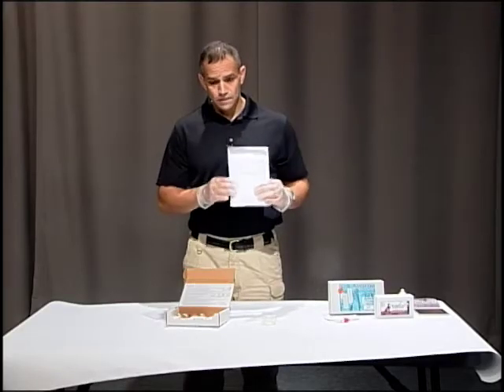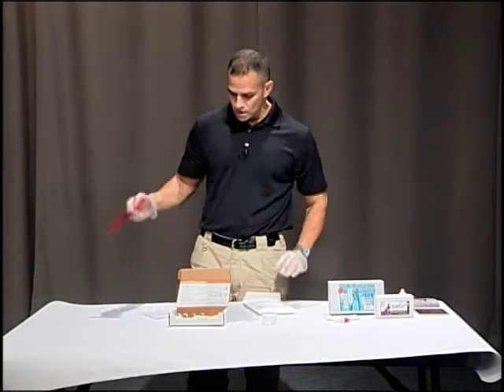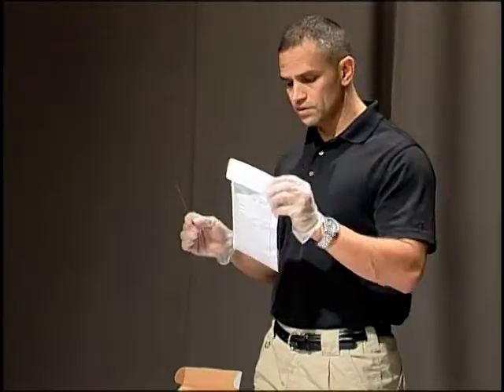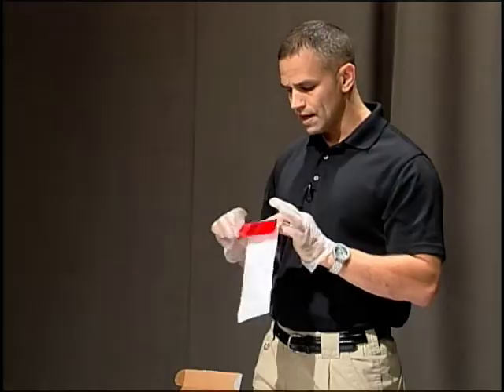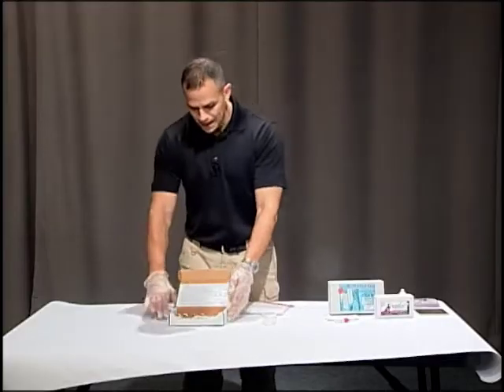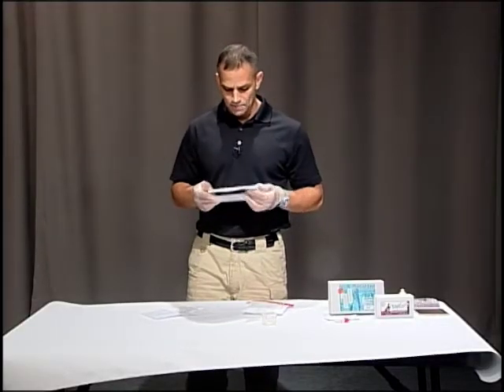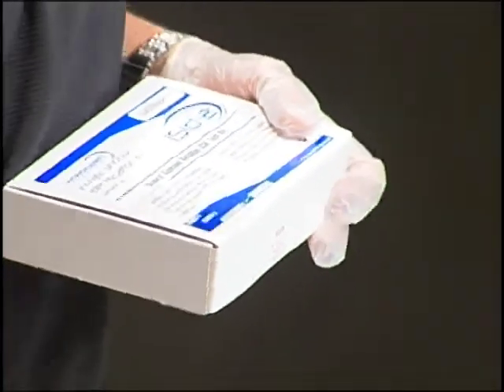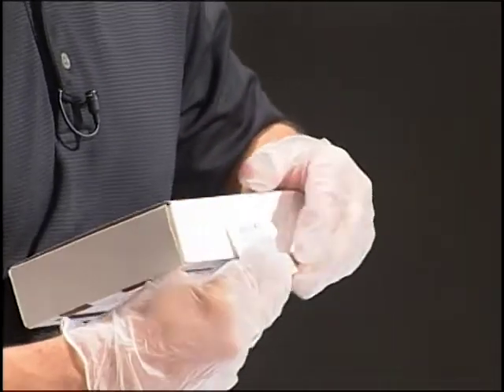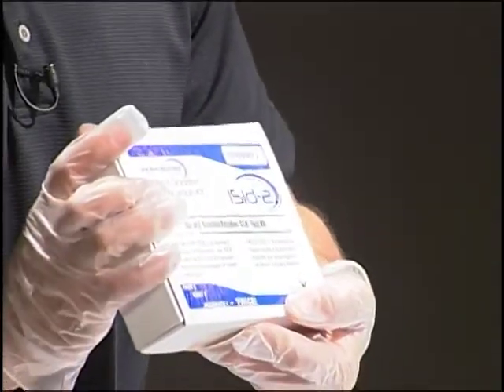Now that we've done our preliminary and lab tests, we need to seal up. The kit comes with an evidence seal. Whether you use your own transport or the one provided, make sure to seal it with evidence tape. You can put your items back into the box, seal them in here, and send the whole box to the lab. It comes with a sticker that says 'Kit to be opened by authorized personnel only' — put that on and seal it with evidence tape.